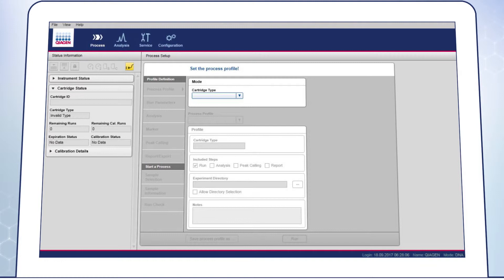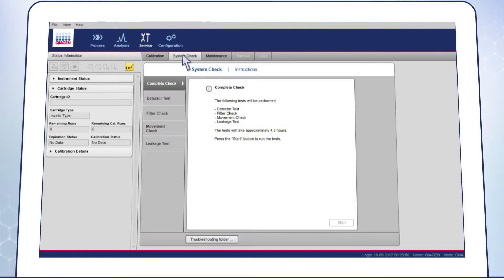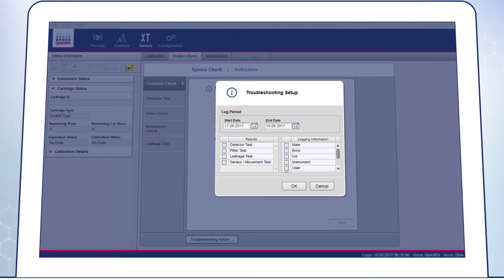1. Troubleshooting Folder. In case of communication issues or if a system check was performed, please create a Troubleshooting Folder by going to the Service Environment and go to the System Check screen and click on the Troubleshooting Folder button below. Select the Start and End Date. Select the Test on the left side if one was performed.